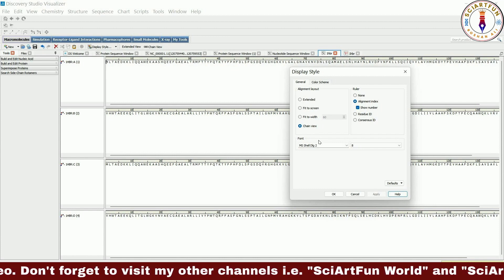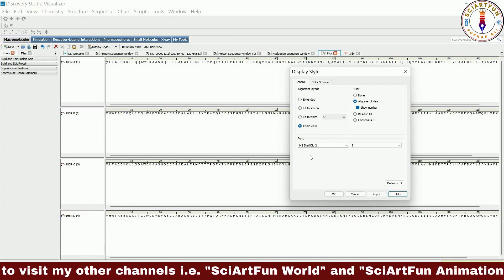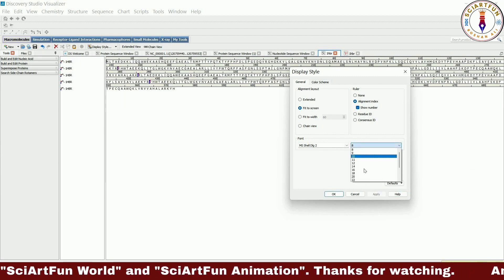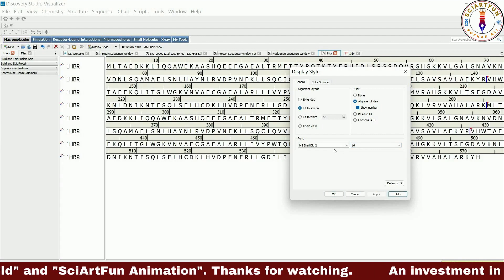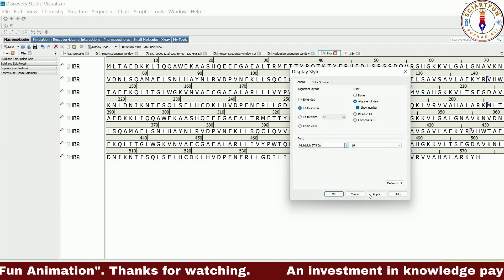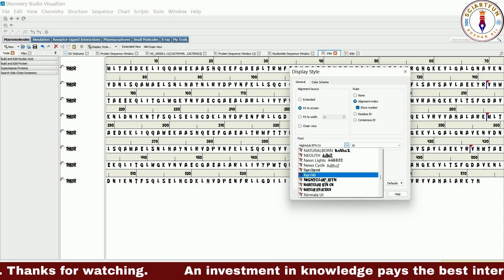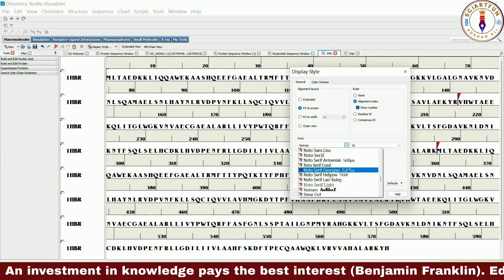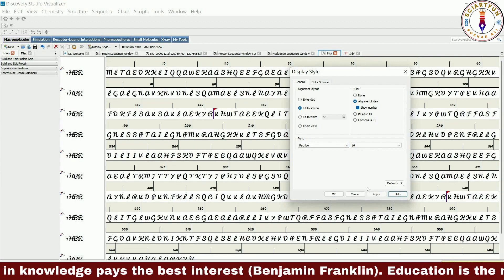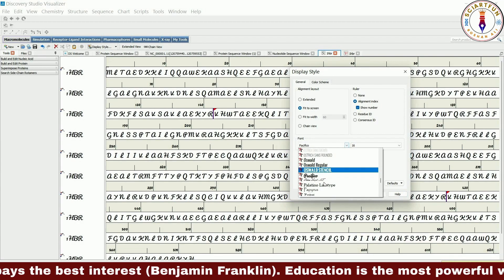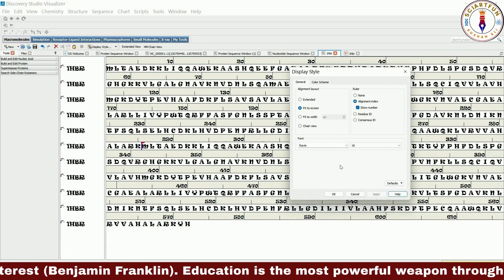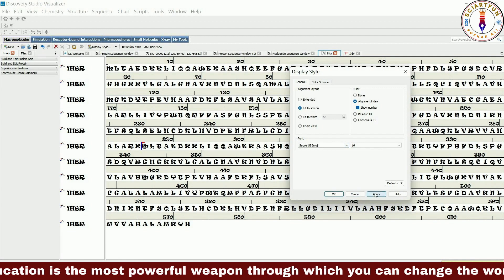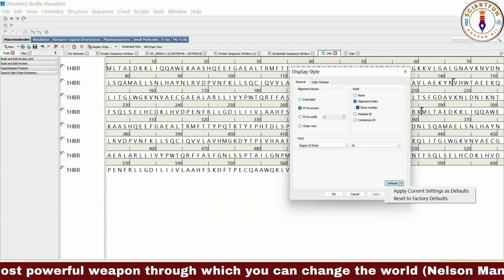The font section has two options. The first option changes the font style while the second one changes the size of the text. Let's increase the size of the text so it can be visible clearly. Now let's change the text style. Let's reset all the things to the factory settings from here.